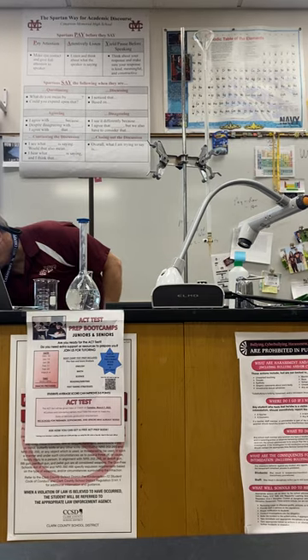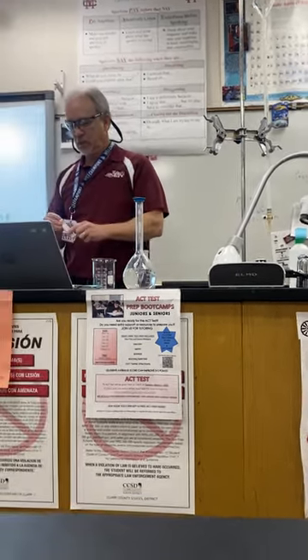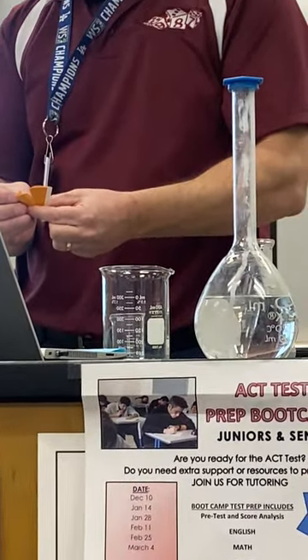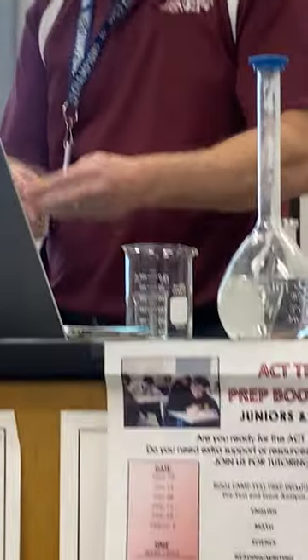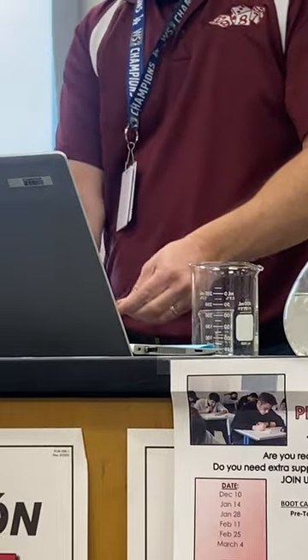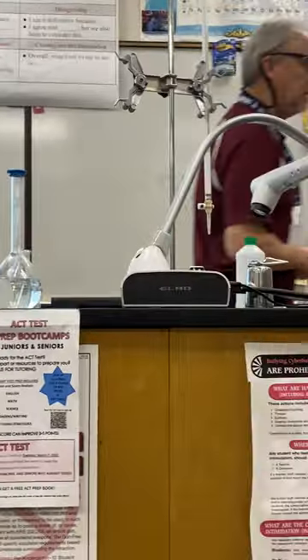I could check it with pH paper and see if it is acidic or basic, because you're either going to have an acid or a base. I'm not telling you if it's going to be strong or weak; people are going to get different ones. So I could take a strip of pH paper and a clean stirring rod.